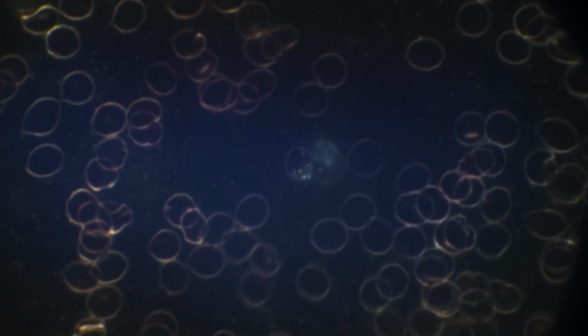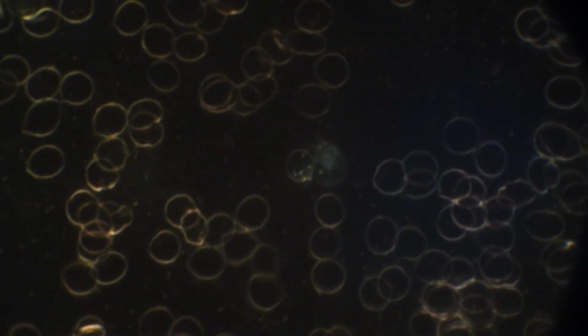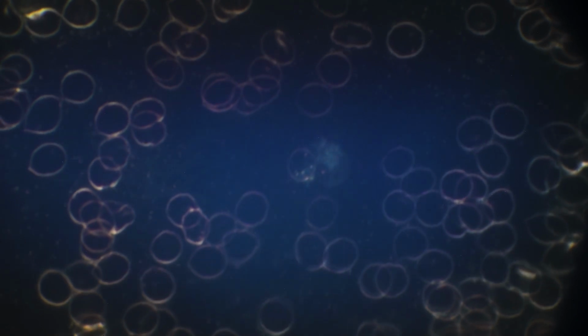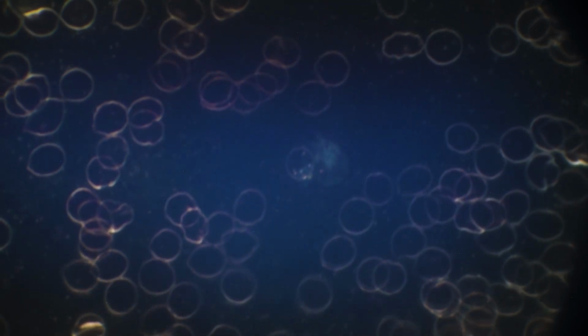I was one of the first actually to do an analysis on a microscope exactly like this at a student's clinic in Canada, and we got a sample of AstraZeneca COVID vaccine, and we put a drop of it on a microscope slide and looked at it under this microscope.